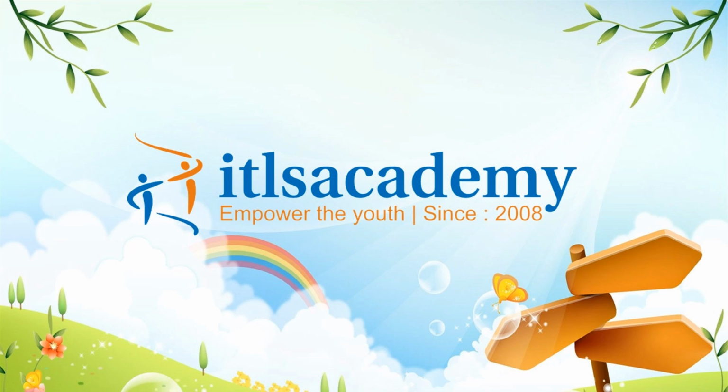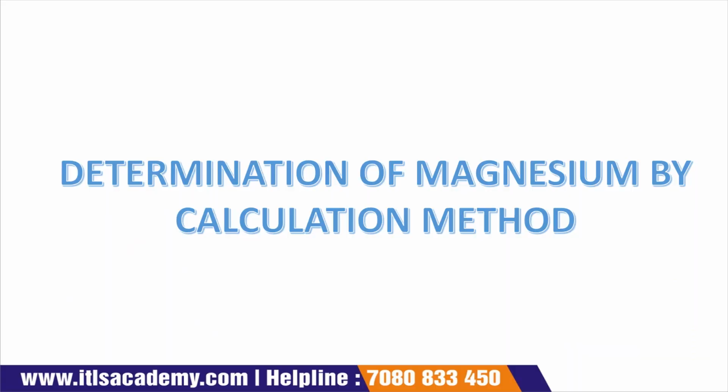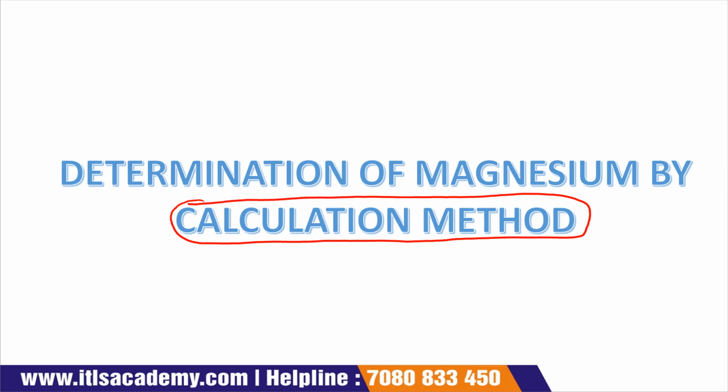Today, the topic that we are going to discuss is the determination of magnesium, and the method that we are going to use is a calculation method. But before starting the lecture, we have to know why we determine magnesium in water, because the sample is water.